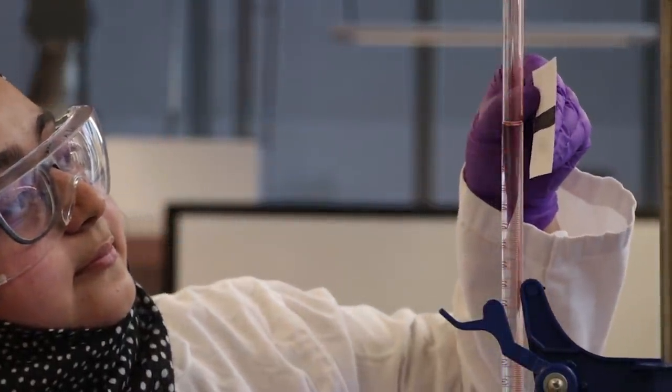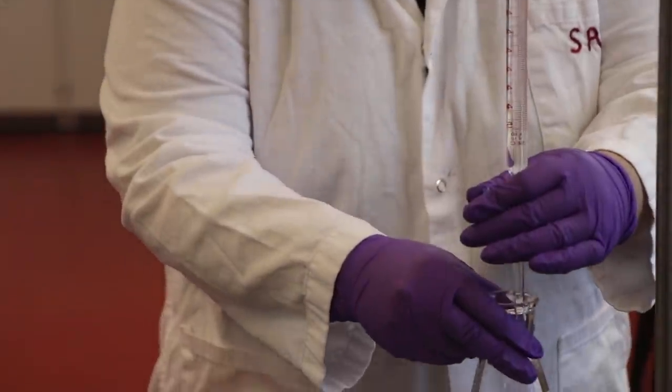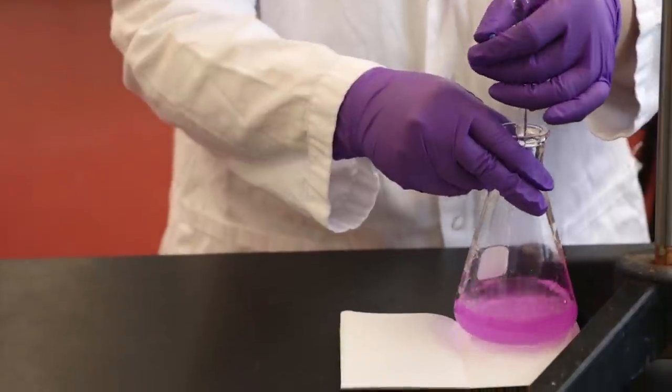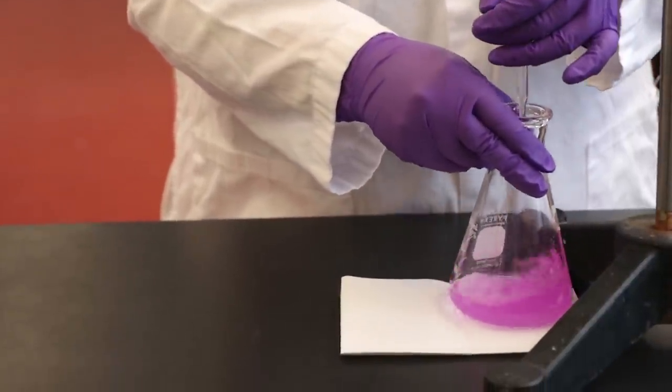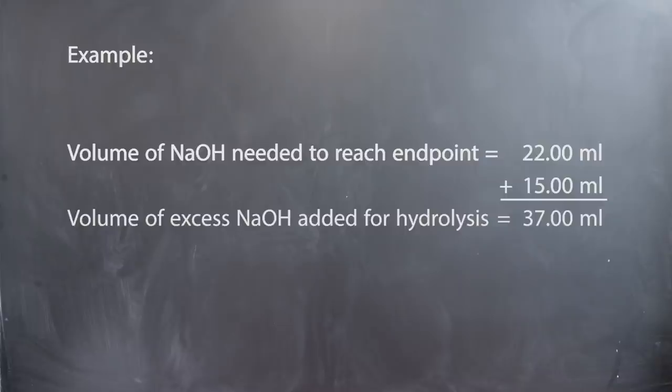Once the endpoint is reached, determine the volume of sodium hydroxide that was needed to reach the endpoint. Then dispense this volume and an additional 15 mL of sodium hydroxide to the flask to hydrolyze the aspirin. For example, if it took 22 mL to reach the endpoint, we need to add 22 mL plus 15 mL, which equals 37 additional mL of sodium hydroxide for the hydrolysis.